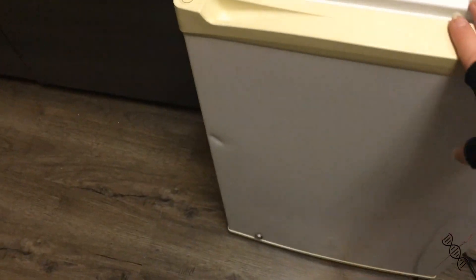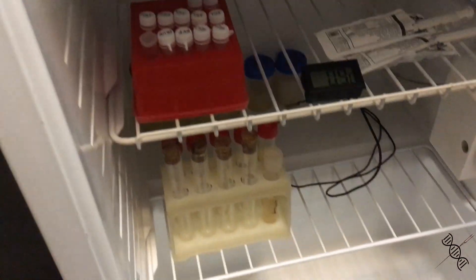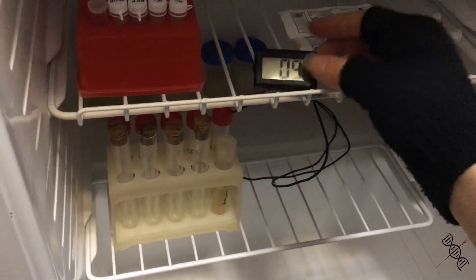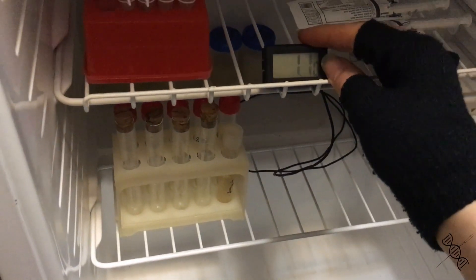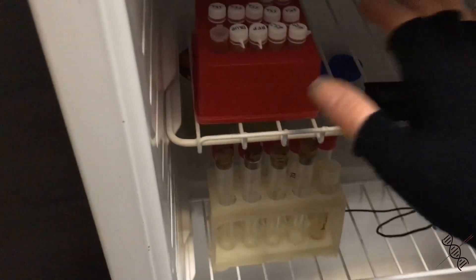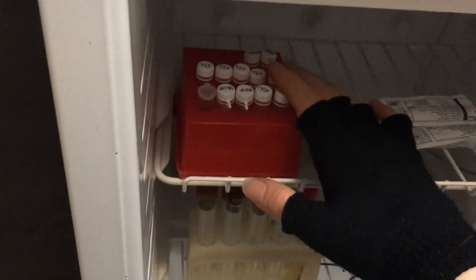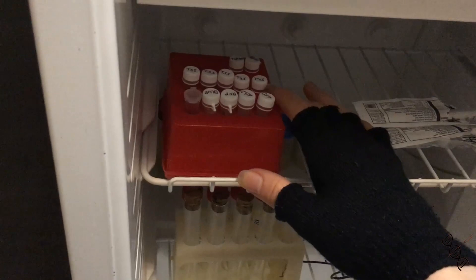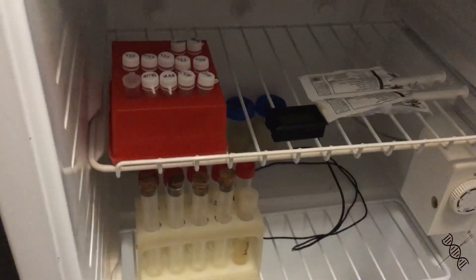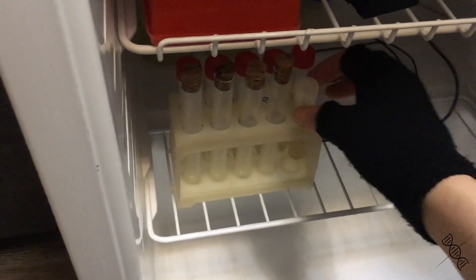Next, I've already shown this box, and here's my fridge integrated with a freezer. It normally didn't have this thermometer, so I put it here — it controls the temperature inside. As you can see, it's normally like one degree Celsius or something. Here is my material — some E. coli BL21, NEB Turbo, a modified one, CFP, GFP, RFP — my glassware with media and stuff.